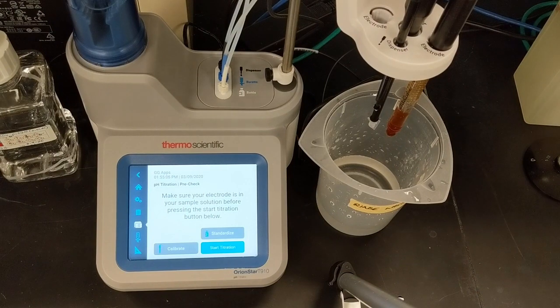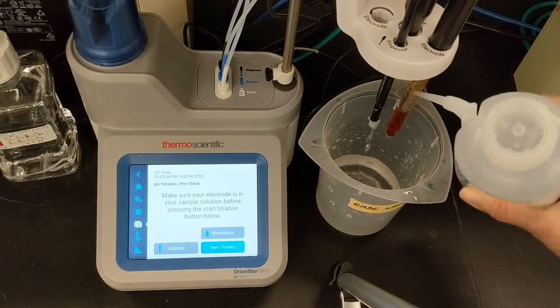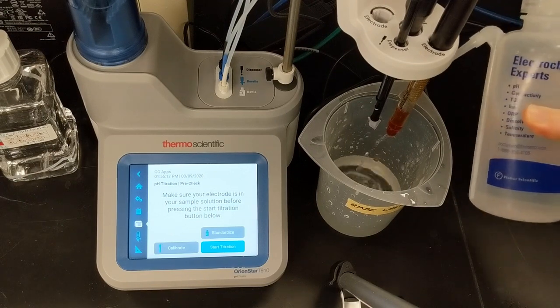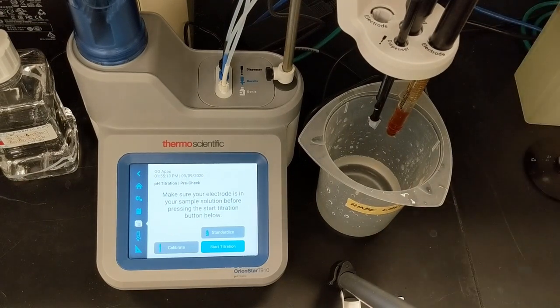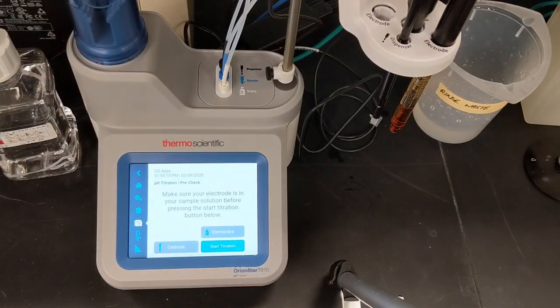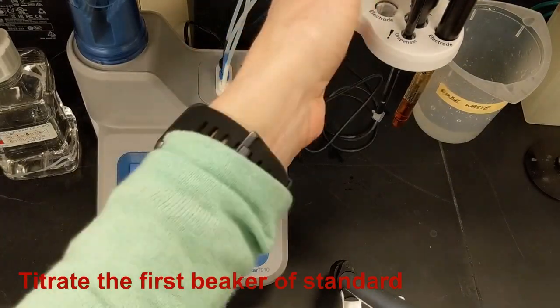Before standardizing, I'll rinse the electrode, dispenser, stirrer, and ATC probe thoroughly with reagent grade water. This prevents any carryover from a previous titration that might contaminate the standards.